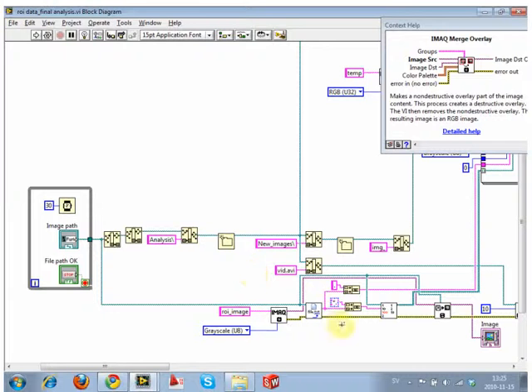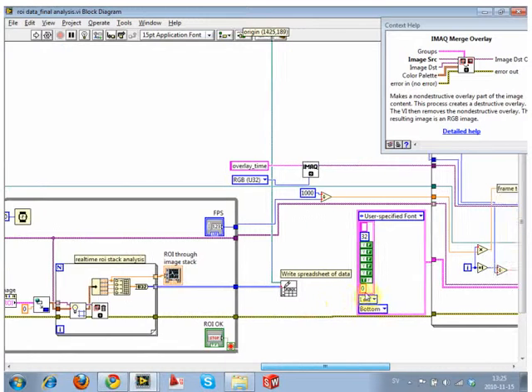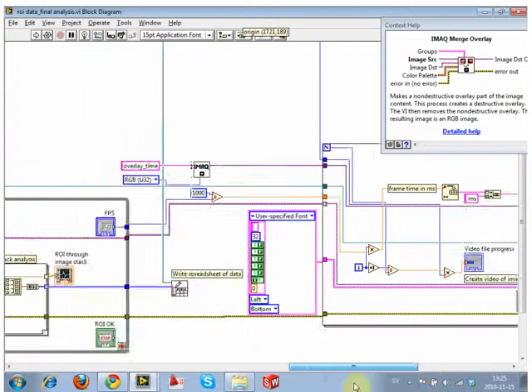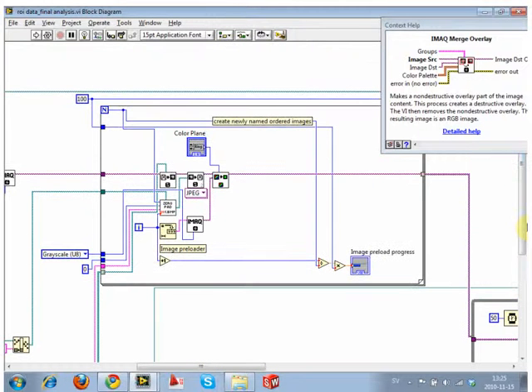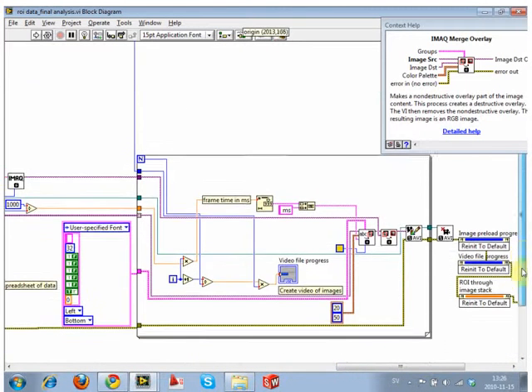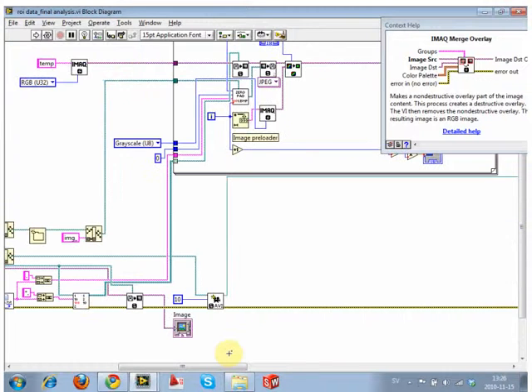And then this bit we'll do as well, and then we'll just keep going and see where we get to. What I'm going to do is keep sections of this live right now and take out big chunks, so that you don't have to construct the whole thing at once. So what I think we should do, if you guys think the same, is we pick a part and then we rebuild it, and then we pick another part and rebuild it, rather than starting with a blank one, because there's not enough time to rebuild this whole thing from blank. And it's more important that you see how each section is built.